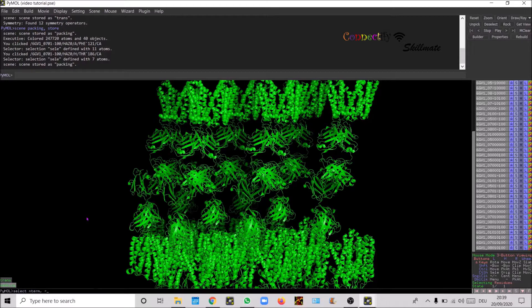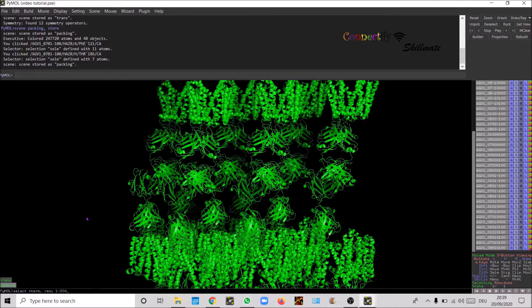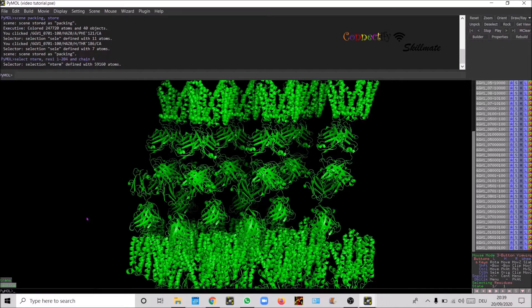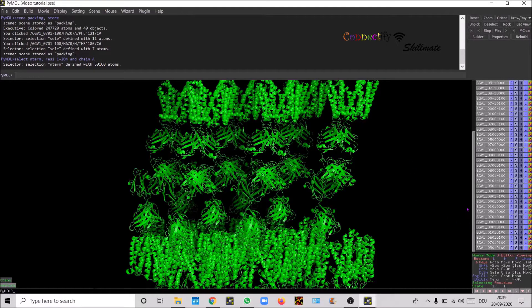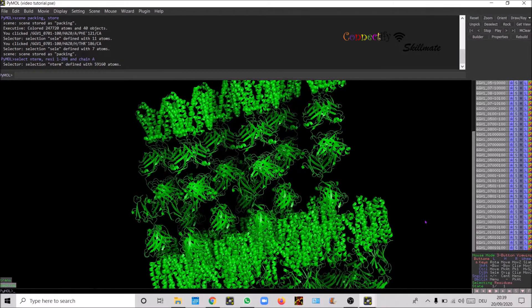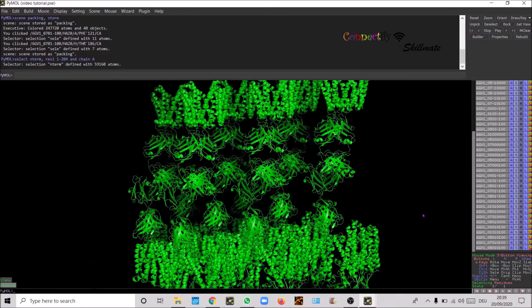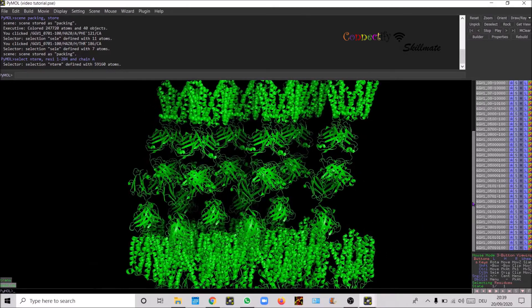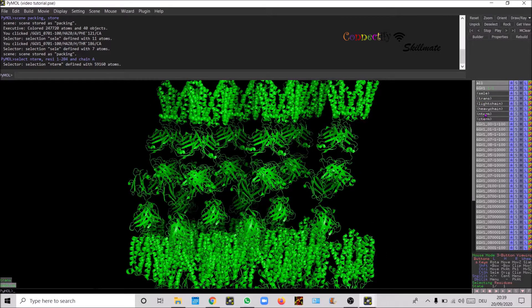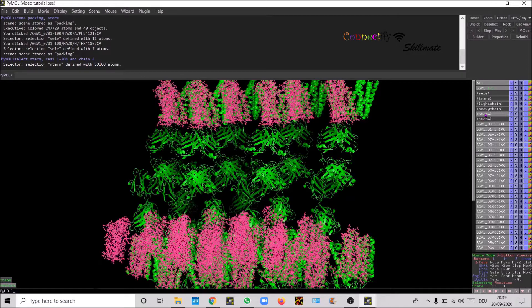Let's define the N-term selection. Select name of the selection and then say you want to select residue 1 to 204 and chain A. You have to define the chain. If you don't define the chain then it's gonna select everything.